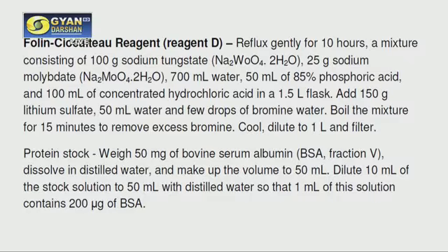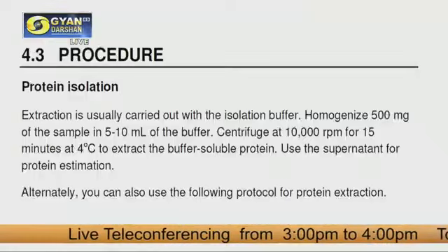If you want to estimate the protein, and learn how to perform this technique, you can use any standard protein like bovine serum albumin, which we call BSA. You can use a stock solution of BSA, and from the stock solution you can prepare gradually increasing concentrations of BSA and then learn how to estimate it. Okay, so the procedure. Now, how will you isolate the protein?